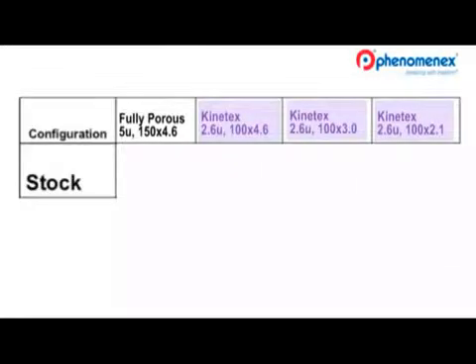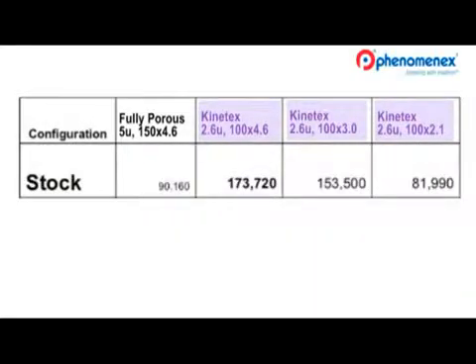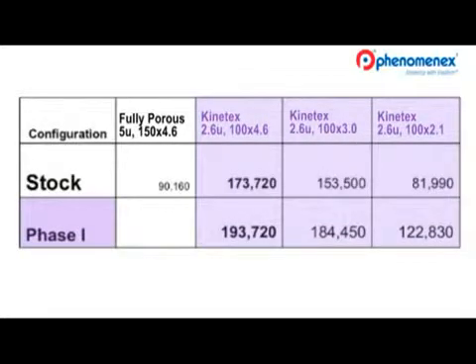Let me show you how effective these simple Phase One changes are on increasing system performance. Before any changes were made to the system, I measured the efficiency of a neutral compound on three different Kinetics core shell columns as well as a traditional full porous particle type column. Even without system optimization, the core shell columns show very high performance. After making the volume reductions just performed, the efficiencies have really increased — these simple modifications have really made a difference.